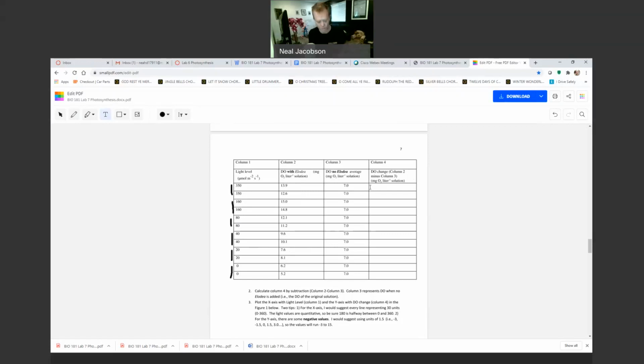When we're calculating the change, we start with what we end with, and we subtract from that what we started with. So we finished with 13.9. I'm going to write this in, you guys don't have to. 13.9 minus 7.0 is equal to 6.9. And it's plus 6.9, right?